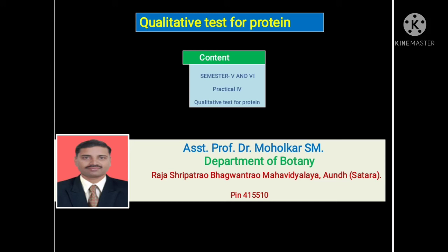Today we'll see practical number 4, that is the qualitative test for proteins. Under qualitative test for proteins, we will see two tests. First of all, we will see the introductory part regarding the proteins.